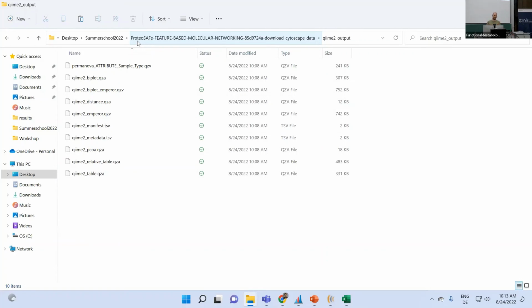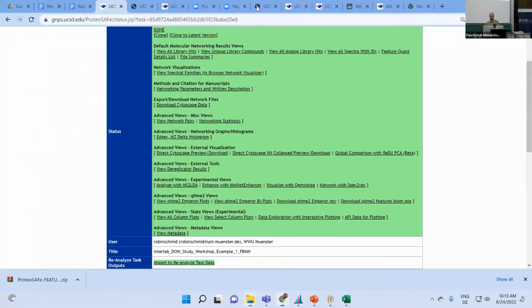So instead of the analysis that Madeleine and Francesco are going to do with you tomorrow, I don't think that this is a final thing, because there was no blank subtraction. It's just a brief overview, but it's very convenient to have this available and then drag and drop it into the QIIME2 viewer and check out, hey, how was my clustering in PCoA space, right? So there's, as I said, a ton of information.